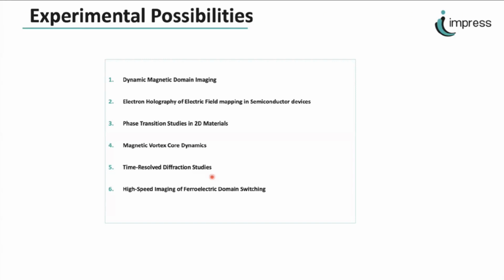We can go further and study the dynamics of the magnetic vortex core in a time-resolved manner. In a phase change material system, for example, we can perform a diffraction study to see the evolution after each pulse. And of course, for ferroelectric material systems, we can study the switching of the ferroelectric domains.